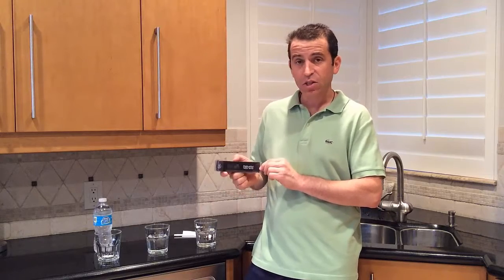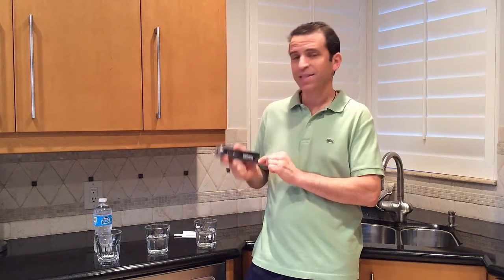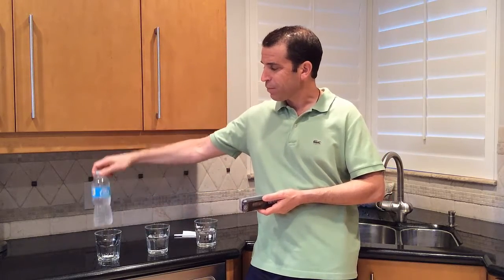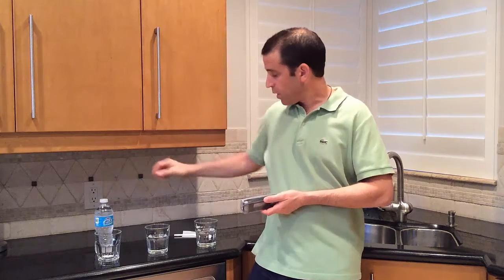I hope you're having a great H2O quality day. We're going to talk about water — do you really have quality water in your home even with a filter like I do? I have a filter on my refrigerator, and I want to share the digital TDS EC meter with you. I'm really excited to test it three ways: first tap water, second refrigerator filter water, and third Nestle Pure Life bottled water. Then I'll write it all down and compare all three.